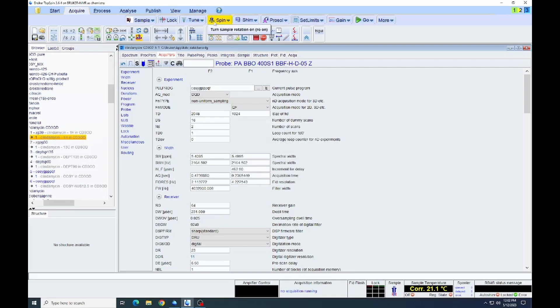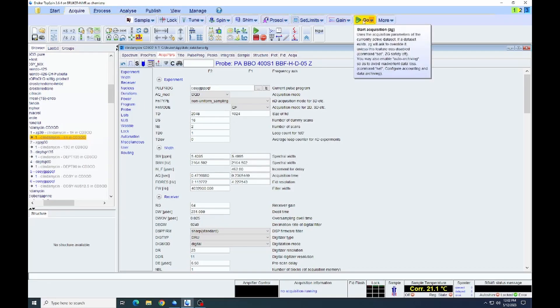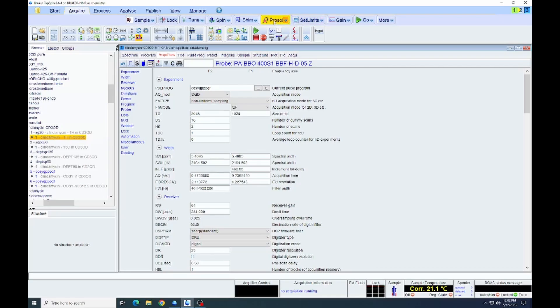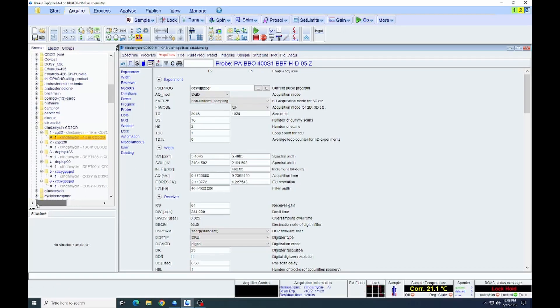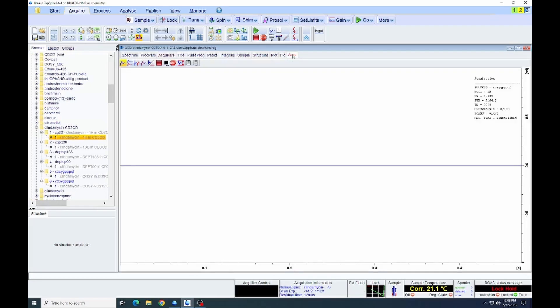We've already locked and shimmed for the previous COSY. So at this point, we can just do prosol and then tell the spectrum to start acquiring by clicking the go. We're not going to wait for the entire acquisition to proceed. So we'll just jump ahead to when the acquisition is completed.